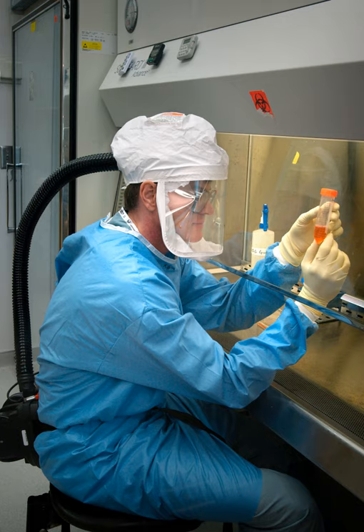Class II cabinets are the commonly used cabinets in clinical and research laboratories. Class III. The Class 3 cabinet, generally only installed in maximum containment laboratories, is specifically designed for work with BSL-4 pathogenic agents, providing maximum protection.